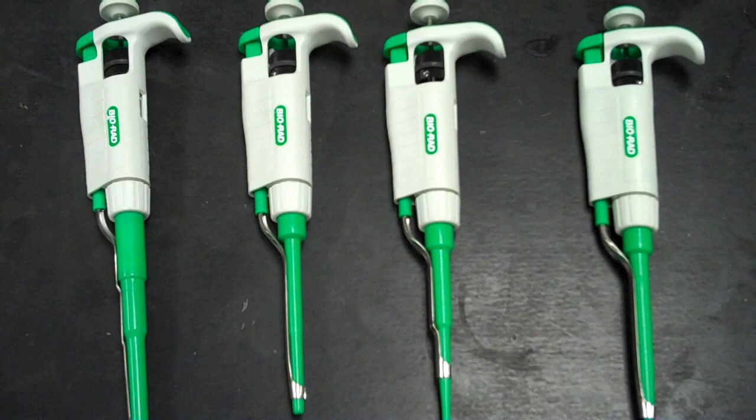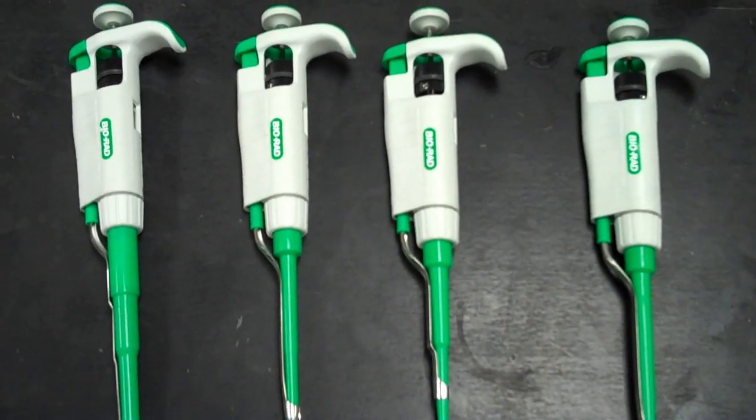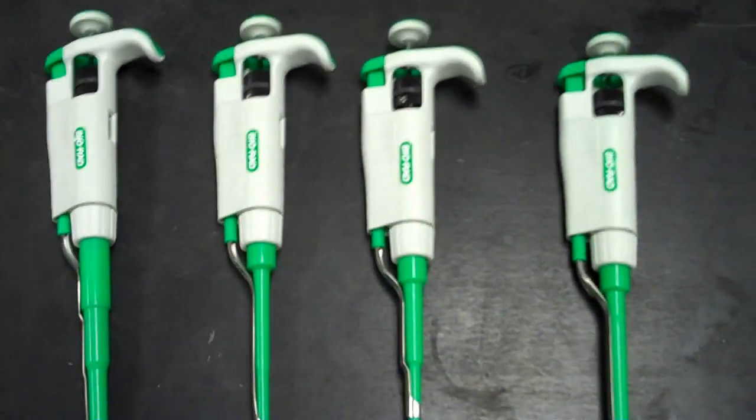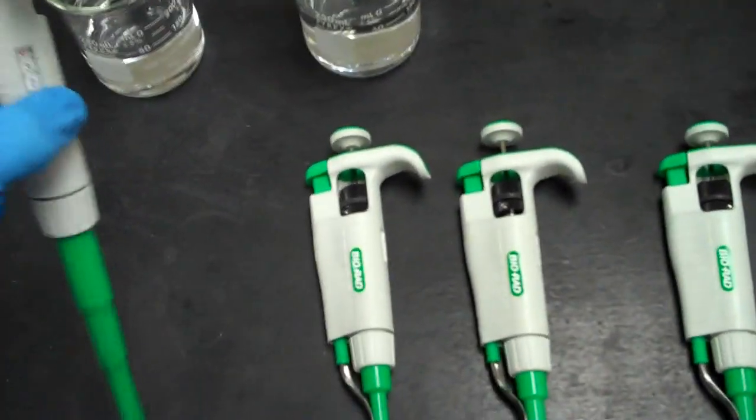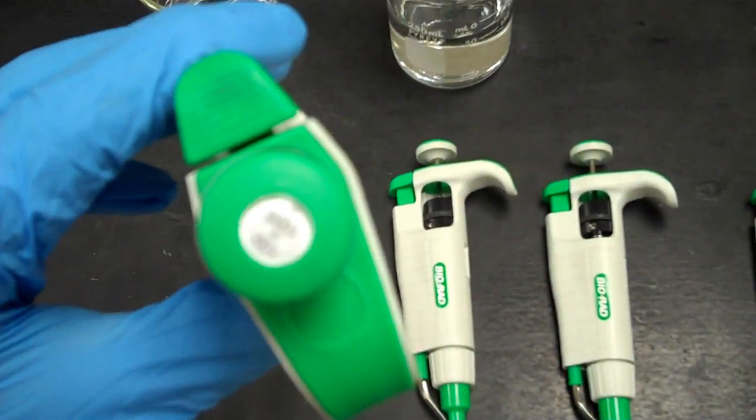The first thing to consider when pipetting is the amount of liquid you'll be pipetting up into the pipetter. Pipetters come in many different sizes. The range of each pipetter in microliters is listed on the top.